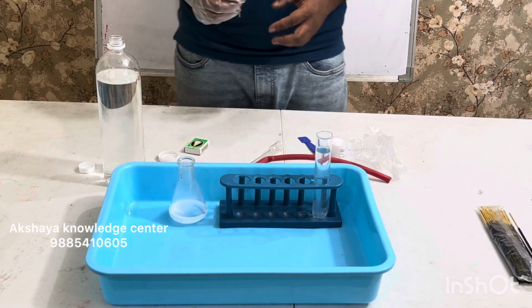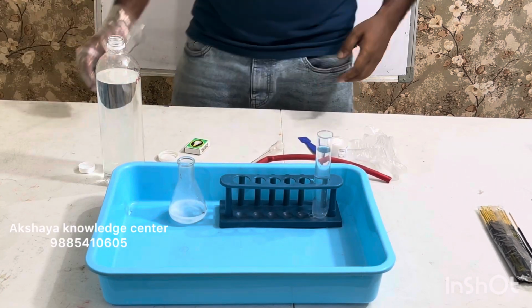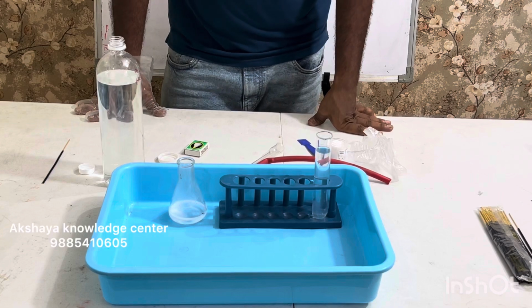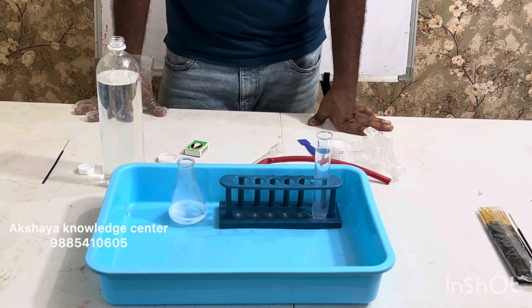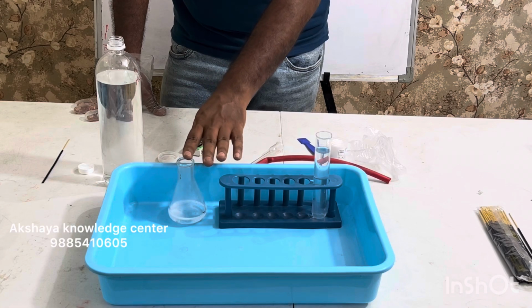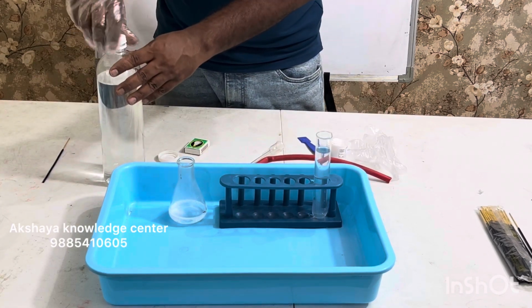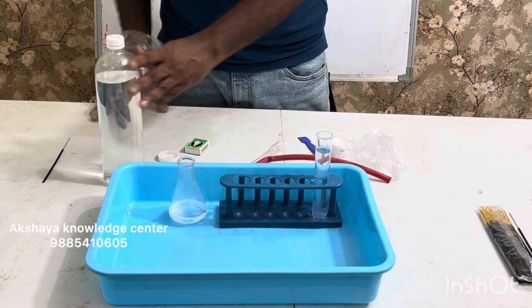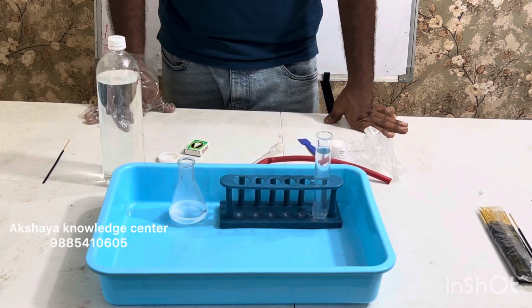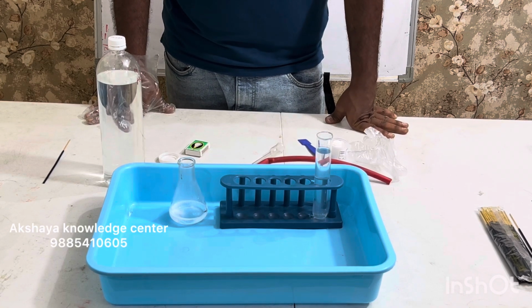Can you tell me which gas does this putting off the flame? The gas that puts off the flame, the one that is very, very familiar to us, is carbon dioxide gas. In fact, carbon dioxide gas is coming out of this conical flask. And check out any fire extinguisher that is near your school or somewhere in apartment buildings or shopping complexes.